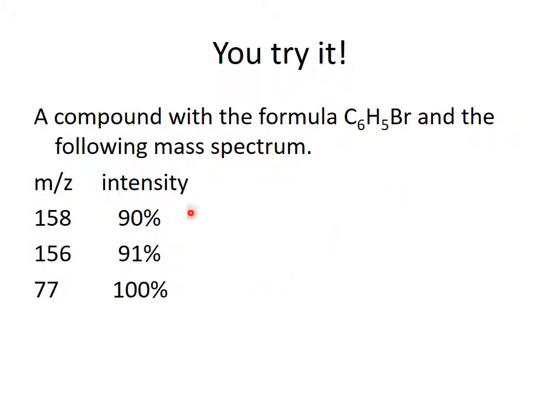First of all, notice that they didn't mention other fragments as being significant. That means most likely they're not, that they weren't big enough to make mention of them. So what do you see? One major peak that is basically the loss of a bromine, because this indicates bromine. Well, let's see what that could be.